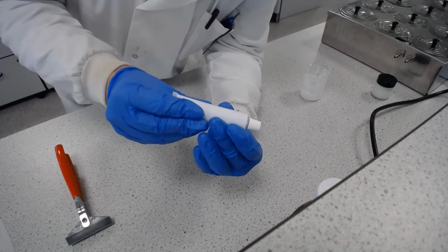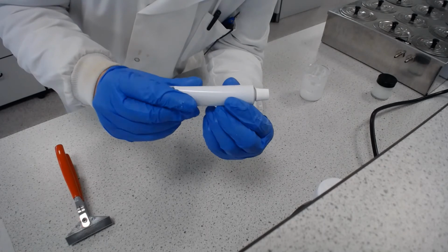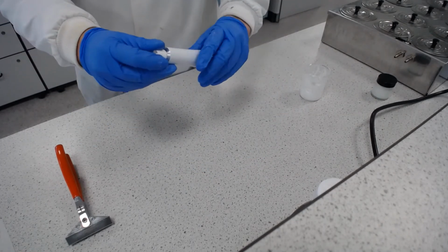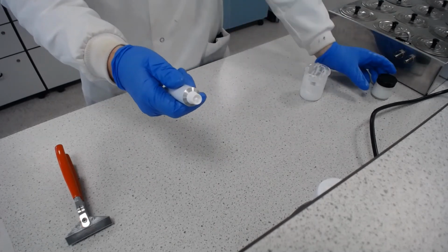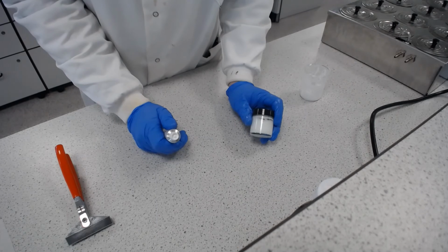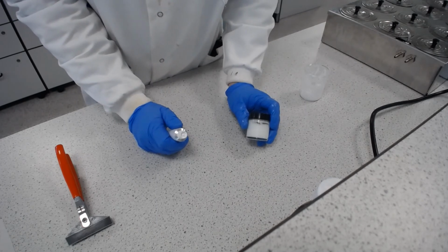And you can see that we've got a very full tube of cream here now. And that's it. You've got a cream in a tube and a cream in a pot. You then put your labels on it, put it in a box, and then hand it out with the appropriate counselling.